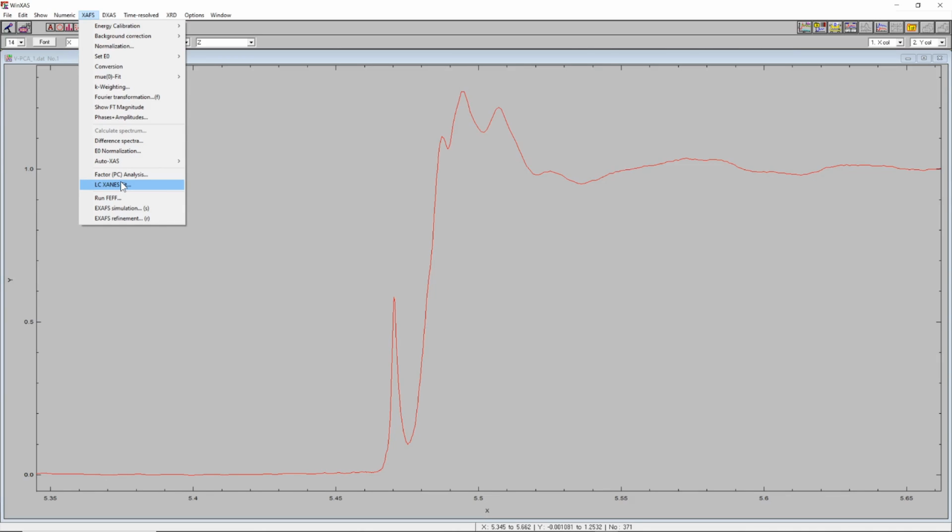We did the principal component analysis now, so we are pretty confident that we need 3 references and that we have those references in our database and that they are the V2O5, VO2, and V2O3 oxides that are present here during this reduction of vanadium pentoxide.